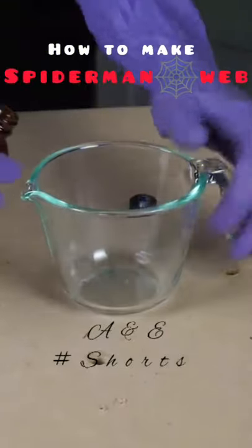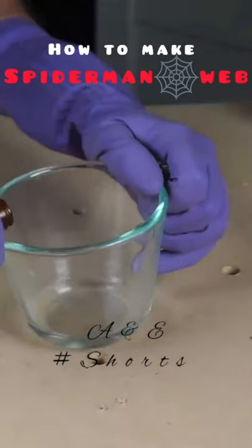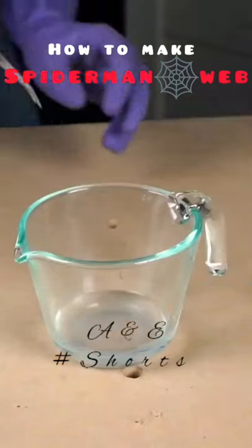First, I'm going to pour in the hexane diamine. Now I'm going to pour in the sebacoil chloride. Okay, here we go.